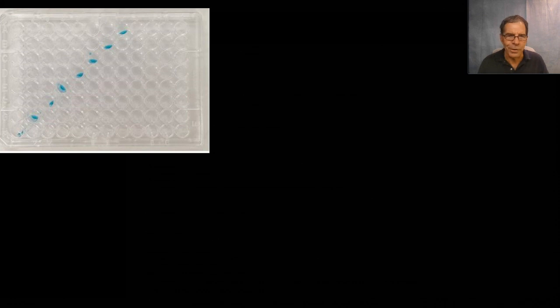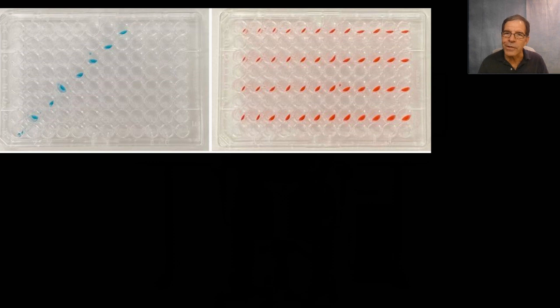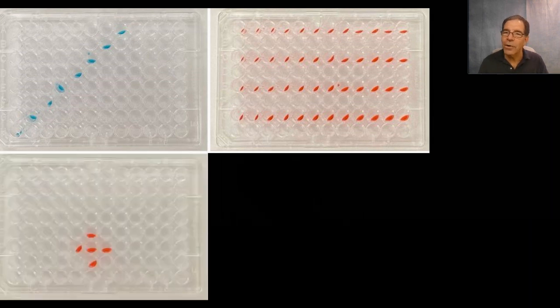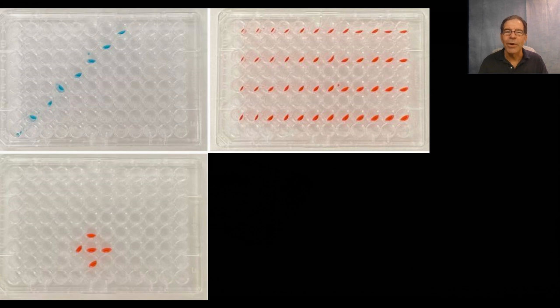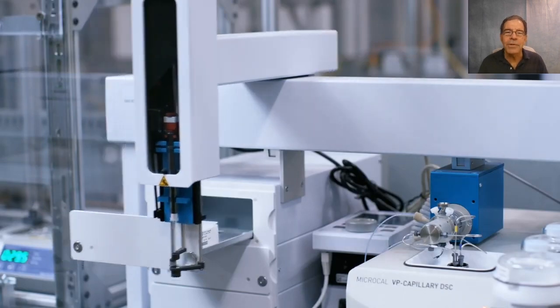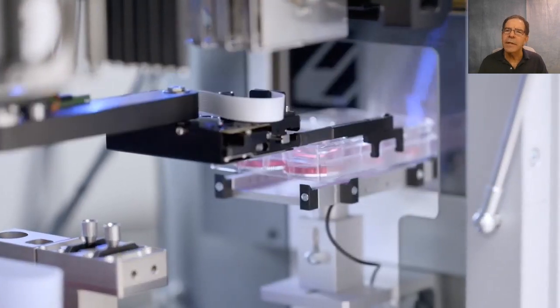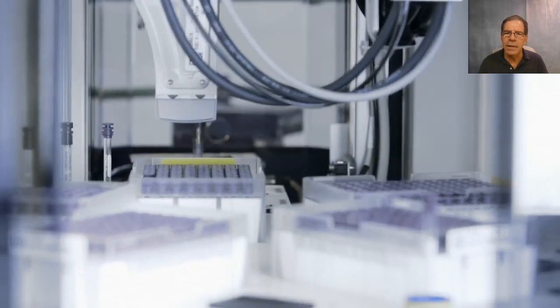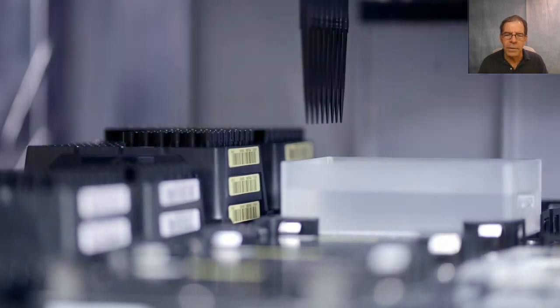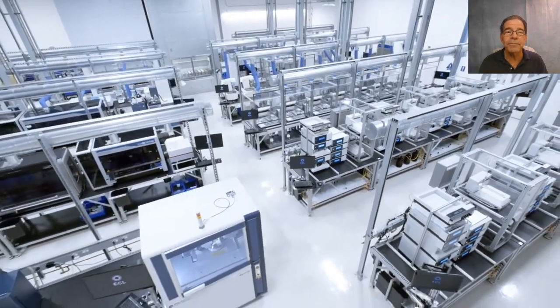Draw a blue diagonal. Color every other row with one color of your choice. Draw a red cross. And draw a 3x3 rectangle using yellow. I wouldn't know how to do those things with lab equipment. As a result of the training, Coscientist was able to conduct experiments without the help of people. And that's possible because of facilities like Emerald Cloud Lab, where robots perform the experiments as directed by computer prompts.